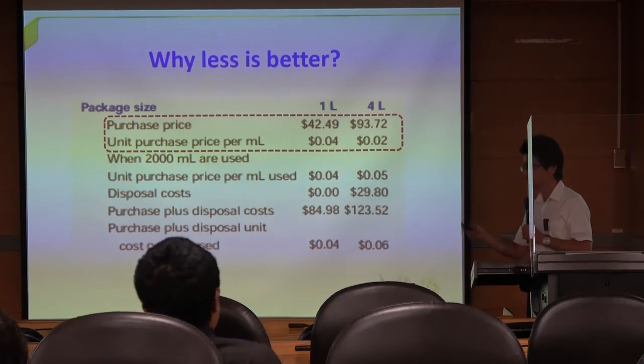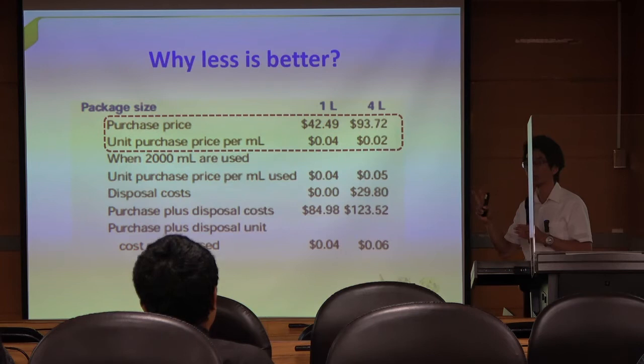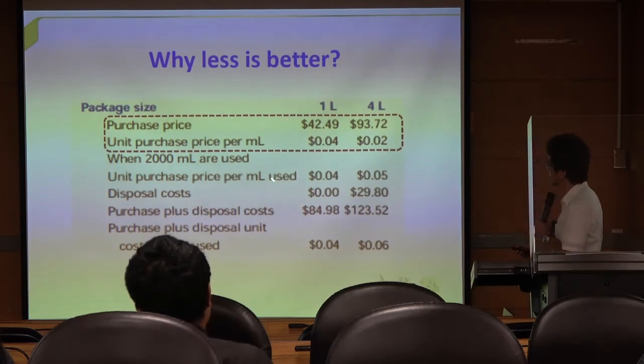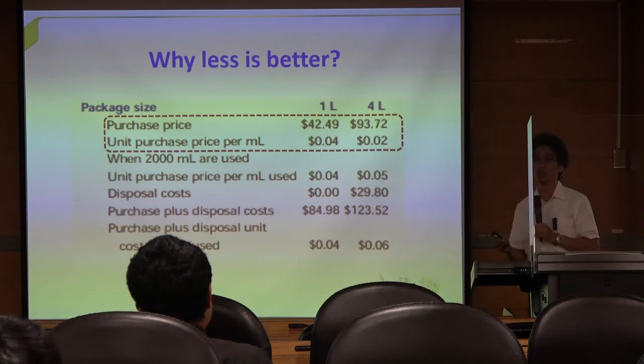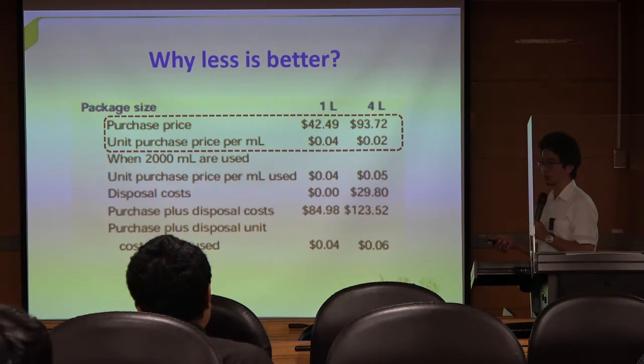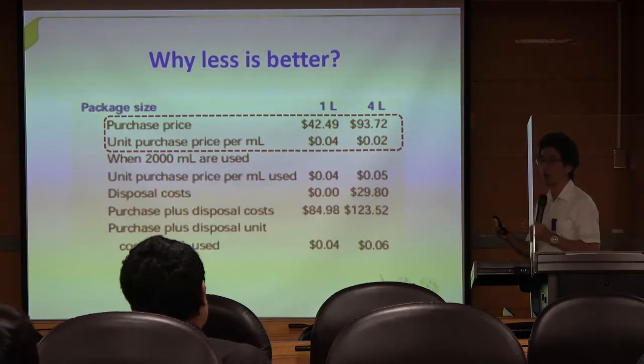If I want to dispose of 1 liter of ethanol, it may cost 200 NT dollars, but you can use the same price to buy a new one. So the disposal cost is very expensive now in Taiwan. I think the regulations are very restrictive everywhere. So only buy enough for your experiment. Don't buy too much. Okay.